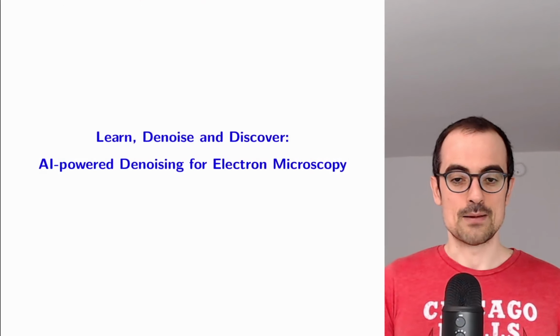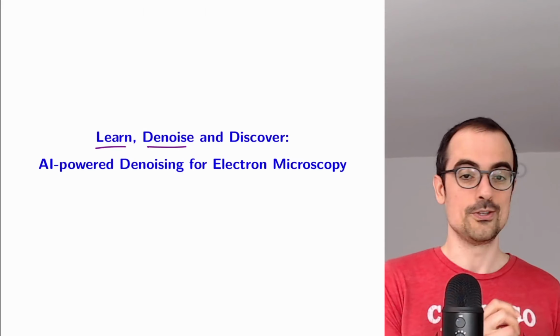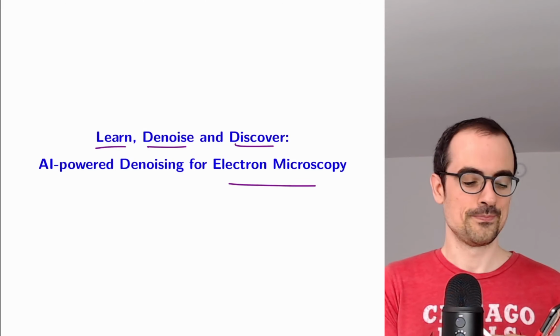I will describe how we trained deep neural networks to remove noise from electron microscopy data in order to reveal the dynamics in the atomic structure of nanoparticles that are important for catalysis. Let's get to it. I'm going to show you how to learn how to denoise using deep neural networks, which can lead to scientific discovery, and we're going to focus on electron microscopy.